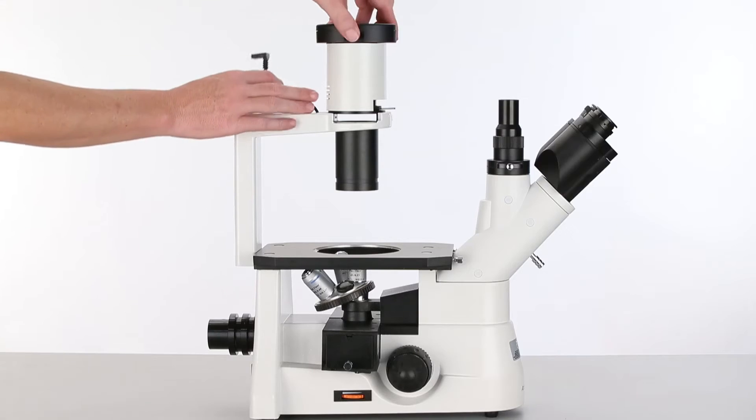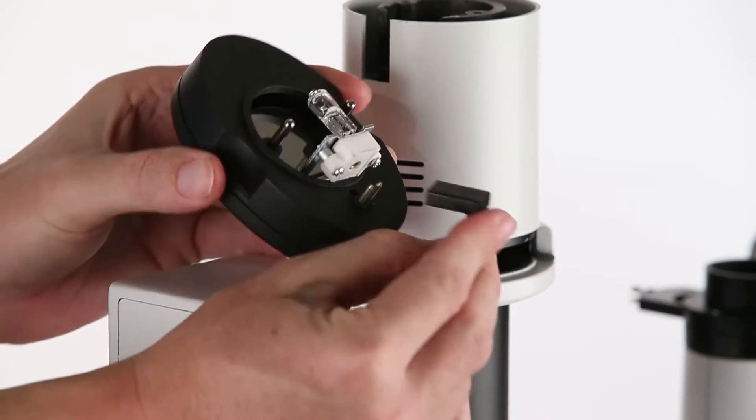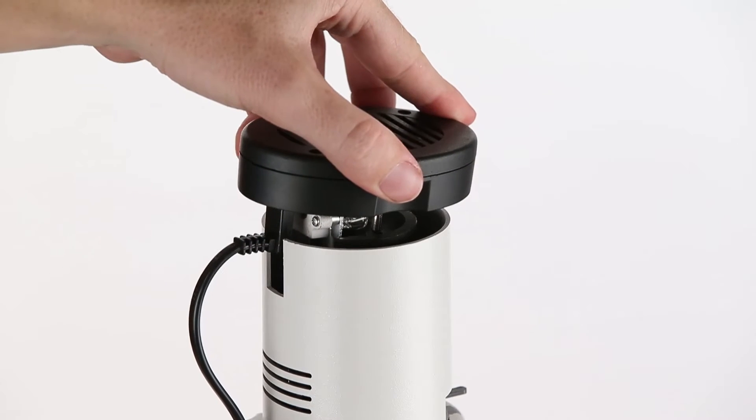Now remove the top of the lighting module by sliding the black part up, exposing the light source. The power lead from the microscope will attach to the two electrical prongs, then carefully reinsert the assembly.